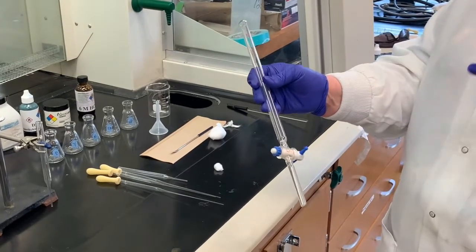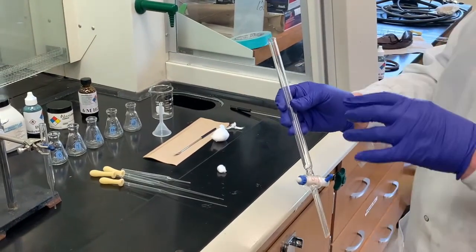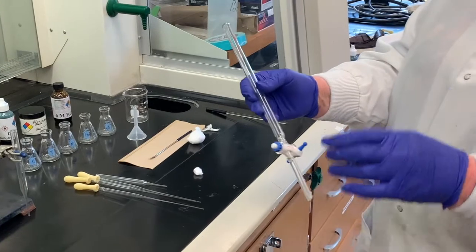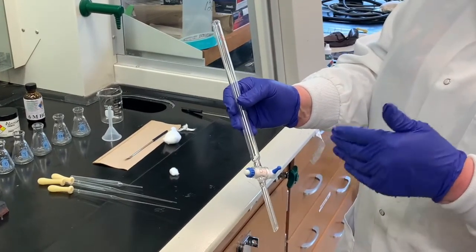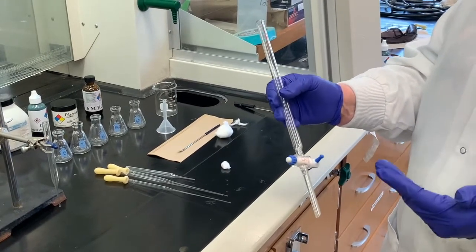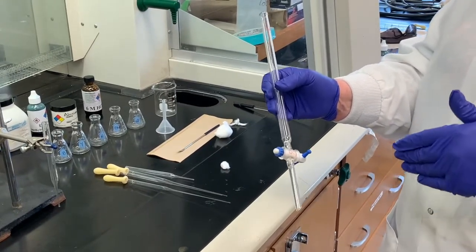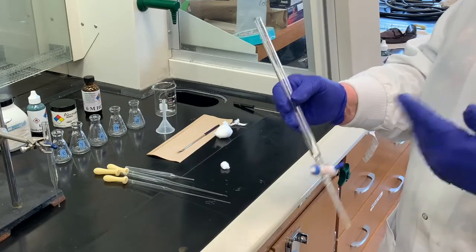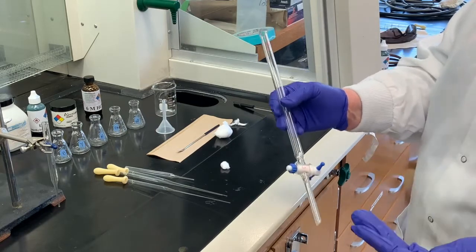Usually thin layer is a precursor to the column experiment. If you remember from the thin layer chromatography, we chose different solvents. We were trying to figure out what was the best solvent system to use to distinguish between the different components of chlorophyll and spinach leaves.